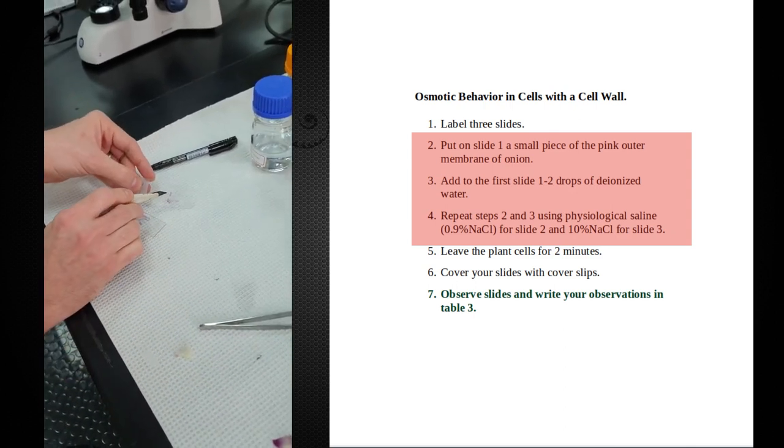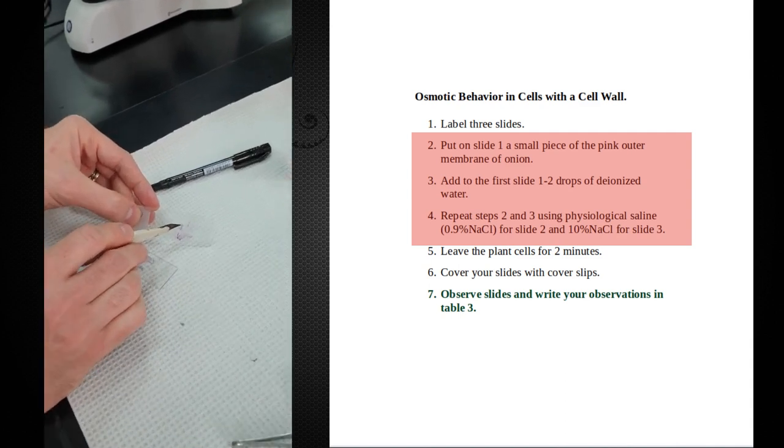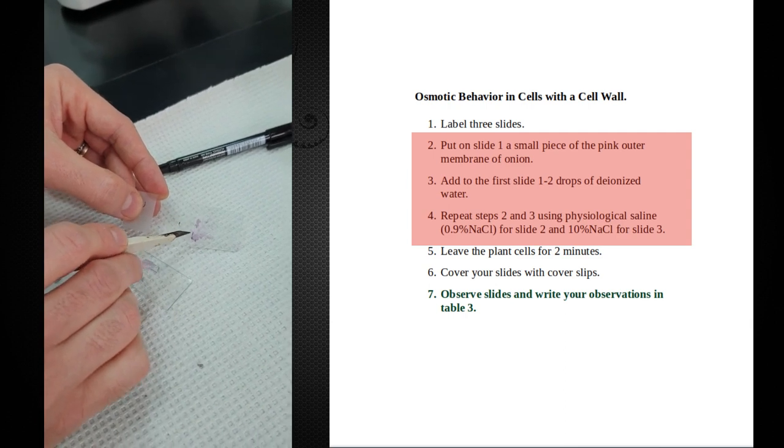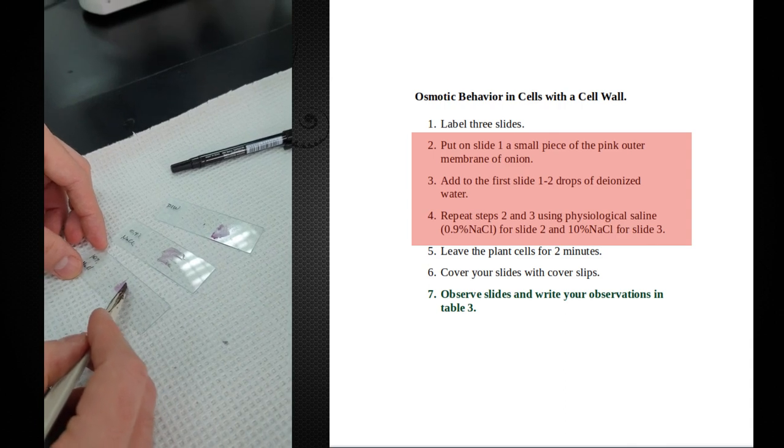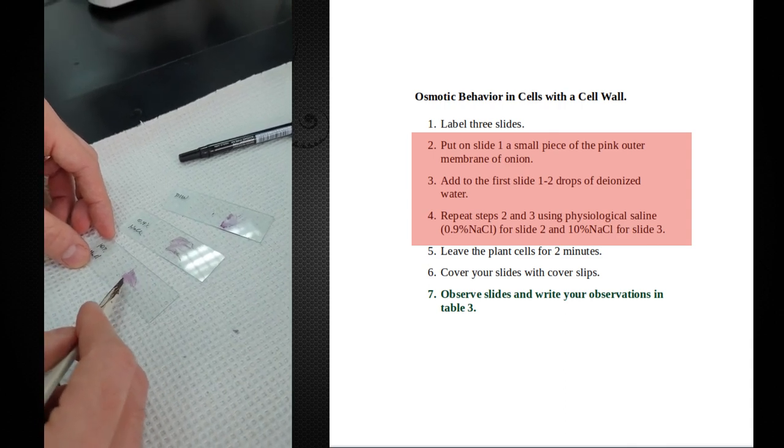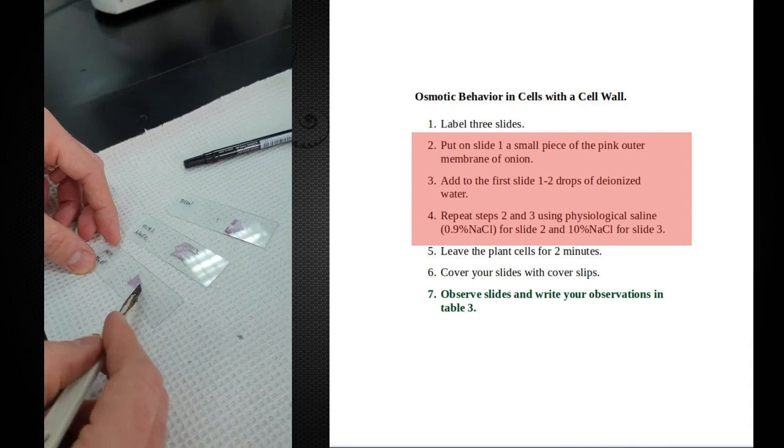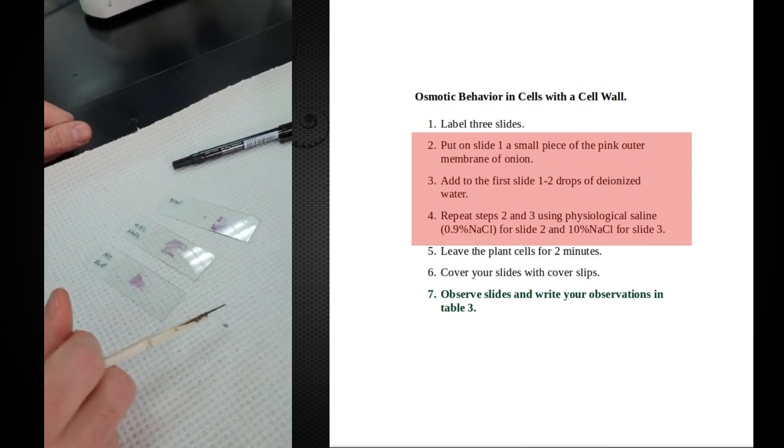The cells are filled with very pink cytoplasm, and so that's really the part that I'm interested in. I'm not too worried about the rest of this stuff. And again, I want to have something that pink on all of these, because what we're going to be looking for are changes to the shape of these cells, whether they pull away from the cell wall or not.